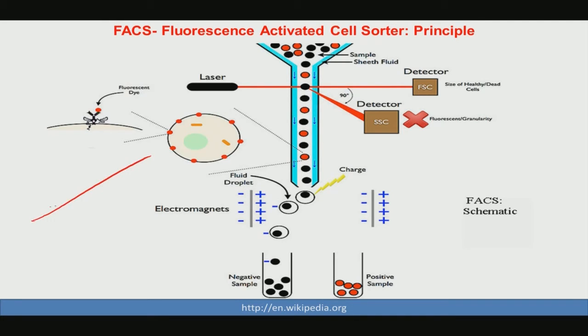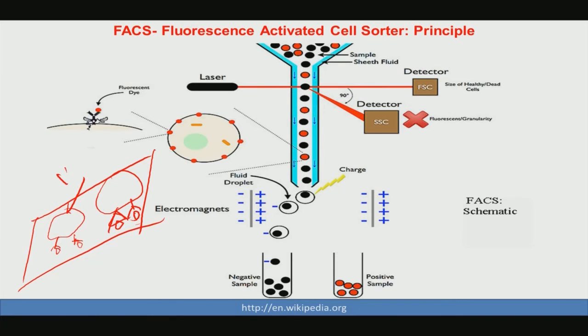Just to give you an idea, when you do some 2-dimensional cell culture on a sample, these cells will spread here, and there will be 10 to the power 5 cells which come and tend to adhere on the material substrate. So, this is a large number of cells, 10 to the 5 cells per milliliter, and when you add so many cells to a biomaterial substrate, you will use certain assays like MTT or LDH or WST1, all these kinds of assays.